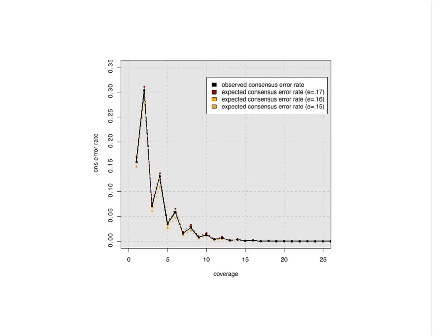Yeah, so the thing that I wanted to add is that Celera Assembler has an unfortunate learning curve, in that you can very easily configure it wrong and make a data set that takes an hour in someone's hands run for a week or two in someone else's hands, because it's very easy to over- or underload a machine and significantly impact your performance. So we're aware of that problem, and we've been working in collaboration with PacBio to try to automate some of these decisions so that the person doesn't have to tune it just right.